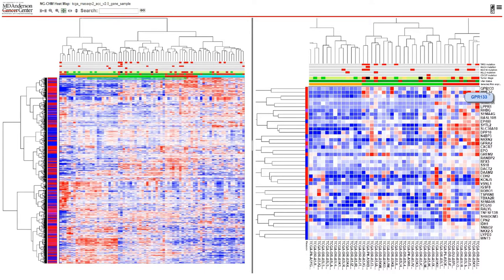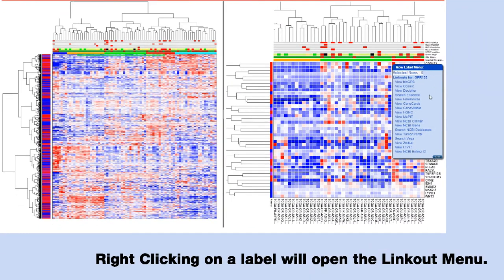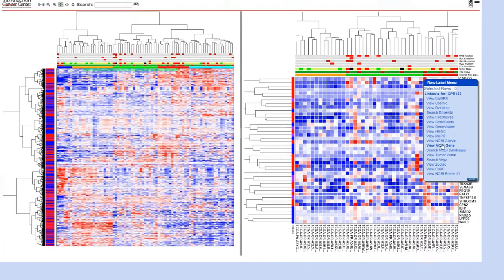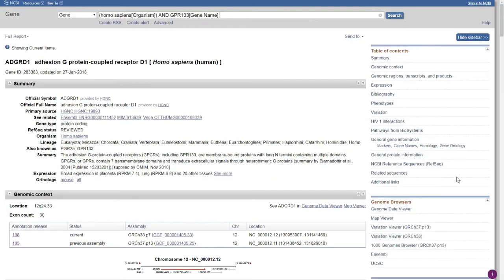For example, you may be looking at a heat map containing gene expression data and would like a summary and/or detailed information about one or more genes. Right clicking on the gene label will display a menu of available link outs for that gene. Selecting a menu entry will perform the corresponding link out action. In most cases, this involves opening a new window or tab containing the requested information. For instance, selecting 'View NCBI Gene' will open a new window or tab containing that selected gene's information.